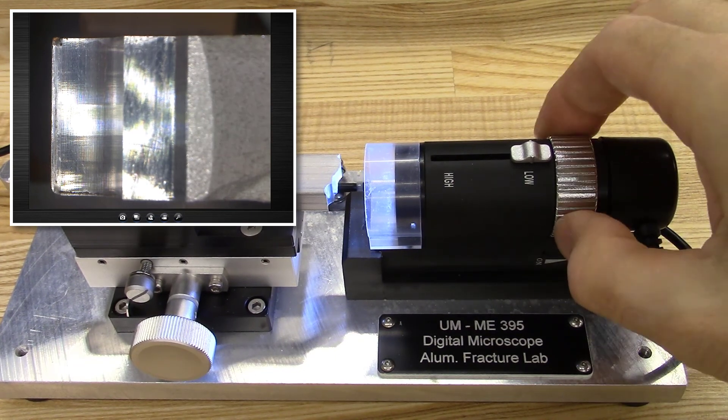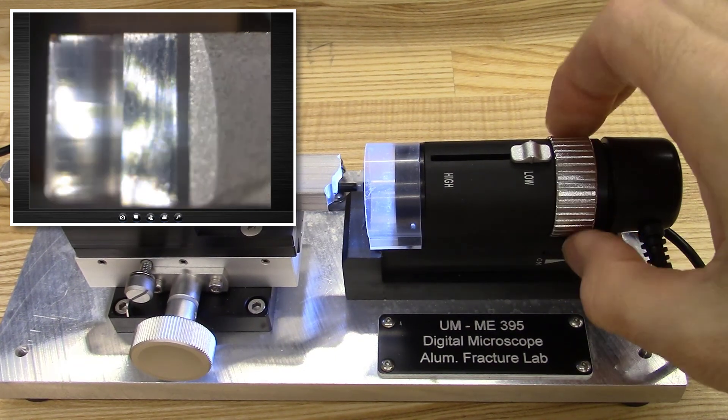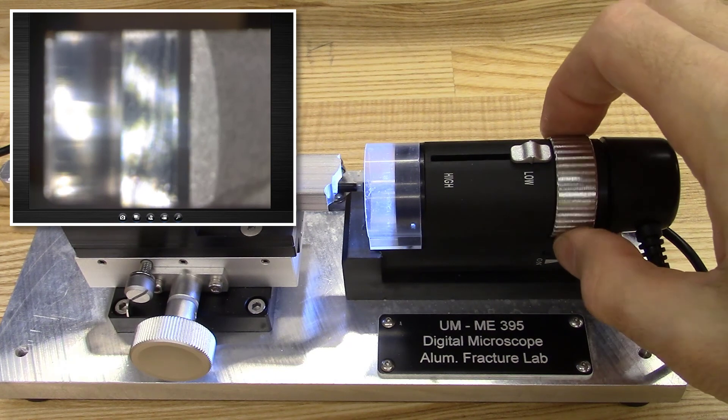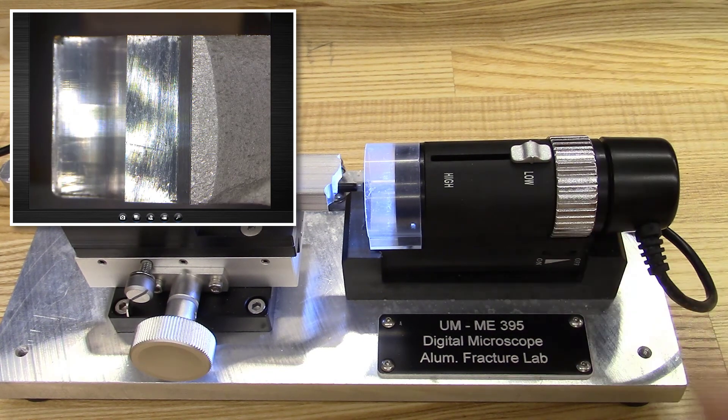After some trial and error, you should have a well-focused view of the entire slot and crack region.